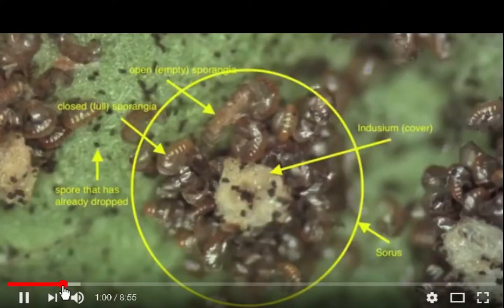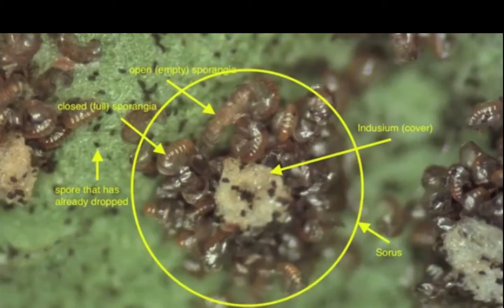Sporangia spring apart and launch the spores into the air. Before the spores are ripe, the sorus is often covered with an indusium, fancy word for a cover. The indusium will retract when the spores are getting ripe. Not every genus has an indusium though. While every genus has differently structured sori, there are a few things that will help you know when to collect.